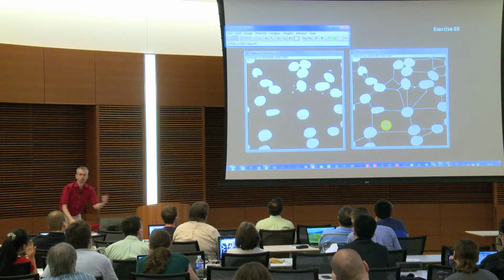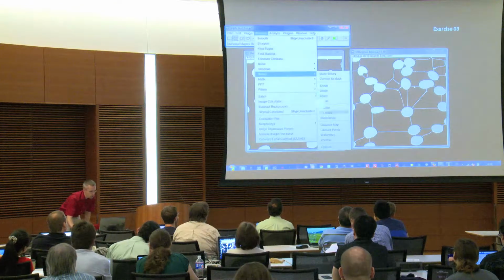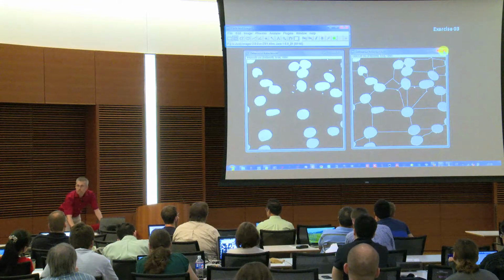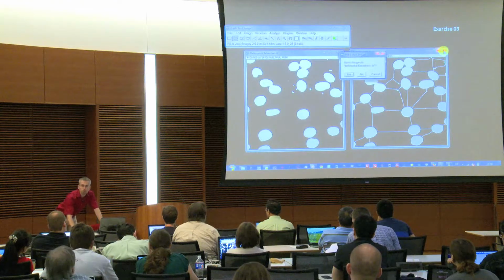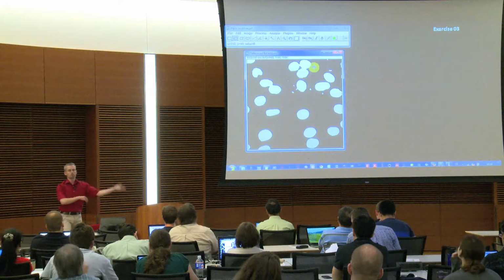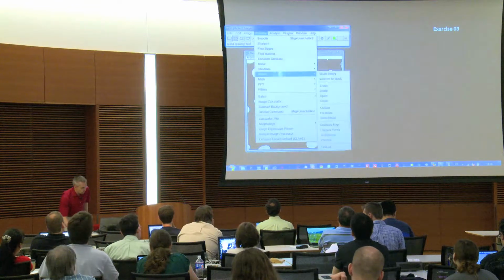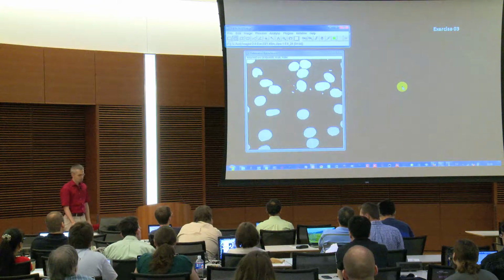So if you see that and you don't want it, then you know, okay, I need to go to process, binary, and switch on the black background. And that is also what Wayne mentioned in the beginning. It's so important in a macro to always specify if you have a black background or not, because otherwise it depends on the settings the user does, and then it works or it doesn't. So now this should work, watershed, and then we could basically continue with our analysis.